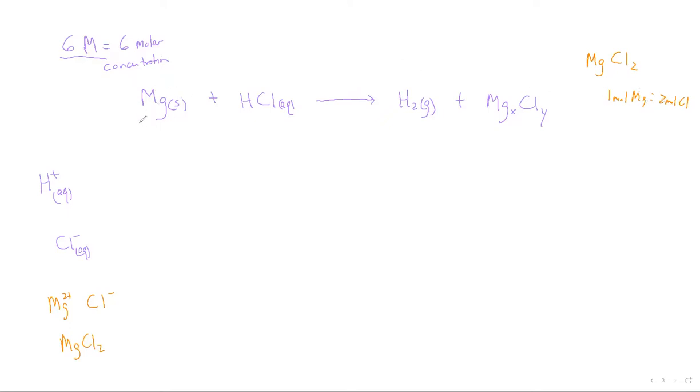All right, we got the mass of magnesium, so we have the moles of magnesium already. The only thing we don't have is the moles of chlorine. How do we get the moles of chlorine? Well, we're going to get it from the mass. So we're going to get our product. The product is going to be wet because this is in water, right? This is aqueous. So the hydrogen goes away, and we're just left with our product.